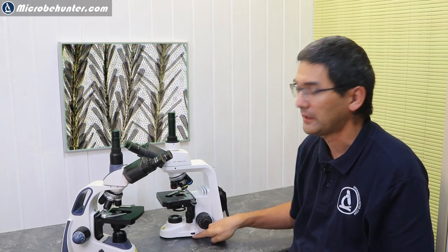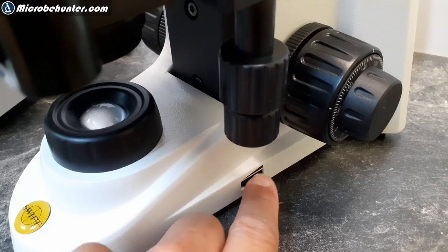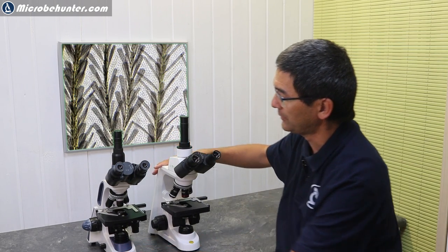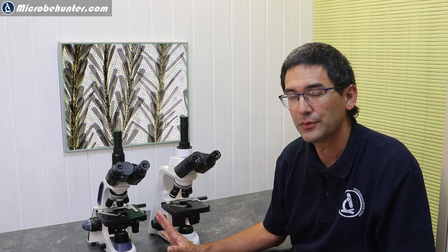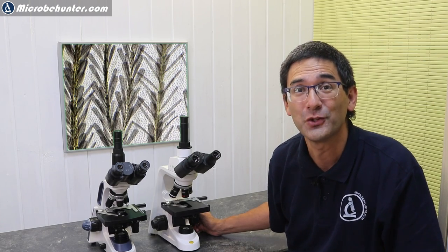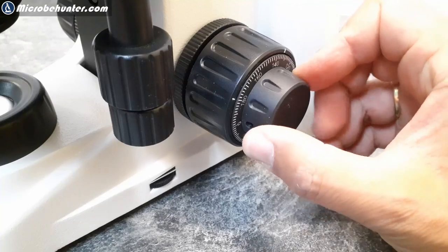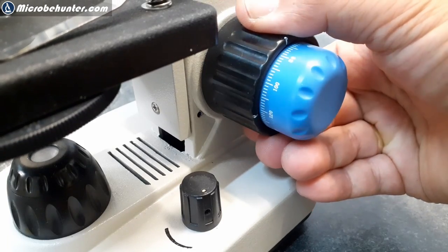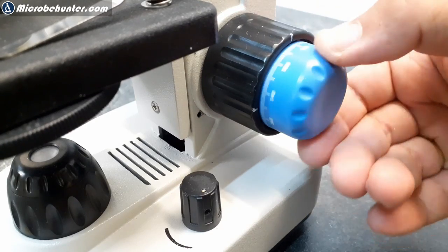One of the things that is really important to say is that both of these microscopes have a pretty good focusing system. This means that when you turn the focusing knob, the coarse focus on these microscopes, the fine focus does not spin fast. So the coarse and fine focus are decoupled—both of them are the same in this respect. This sets them apart from low-cost introductory microscopes where the focus knobs are not decoupled. When you turn the coarse focus and the fine focus spins fast, I think that does not give as much precision. The good thing is that those microscopes are actually a little bit better in that respect.